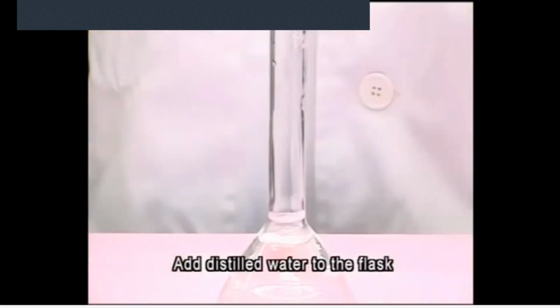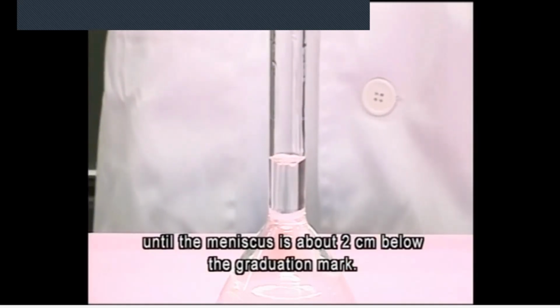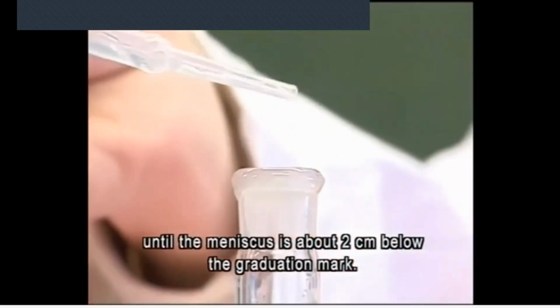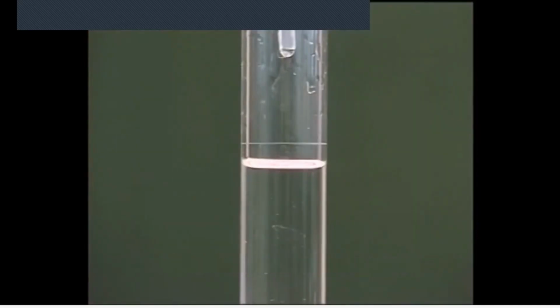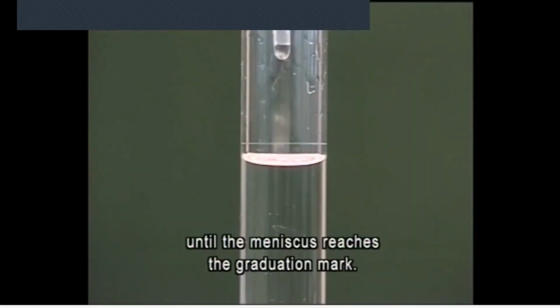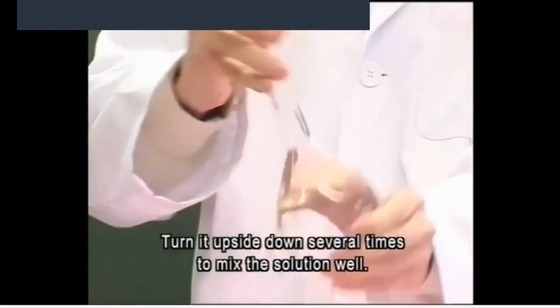Add distilled water to the flask until the meniscus is about 2 centimeters below the graduation mark. Add distilled water using a dropper until the meniscus reaches the graduation mark. Stopper the flask. Turn it upside down several times to mix the solution well.